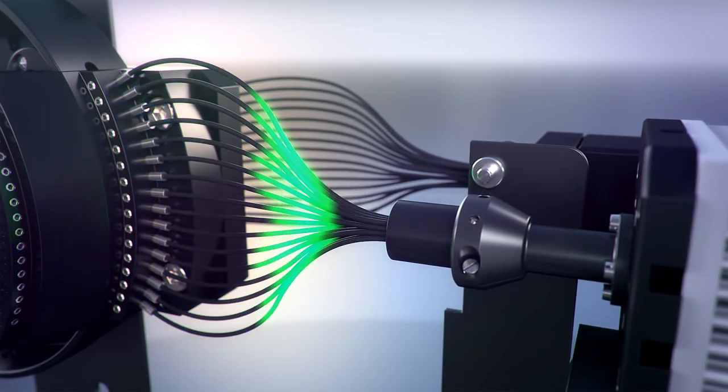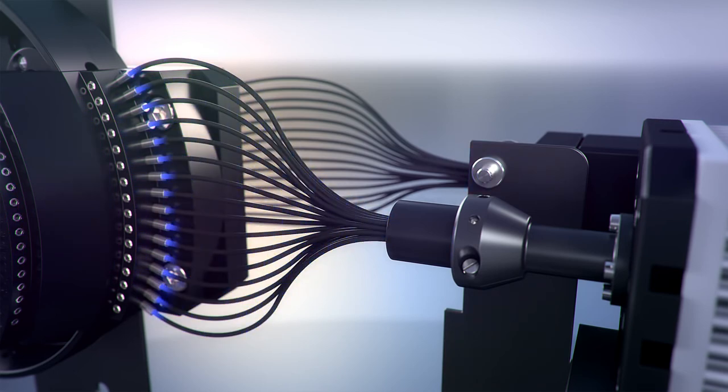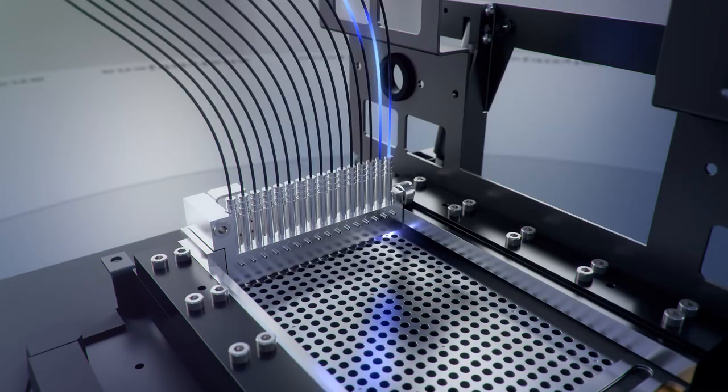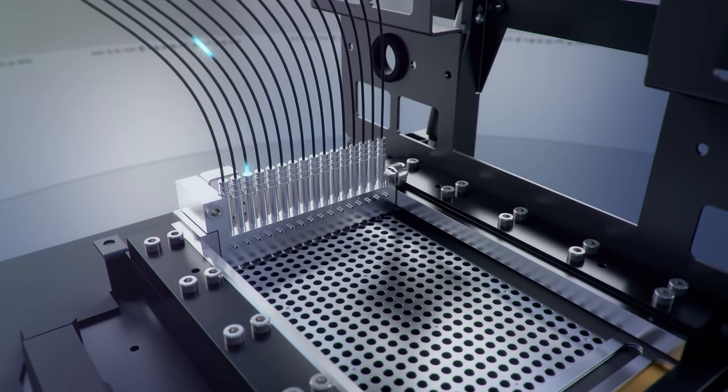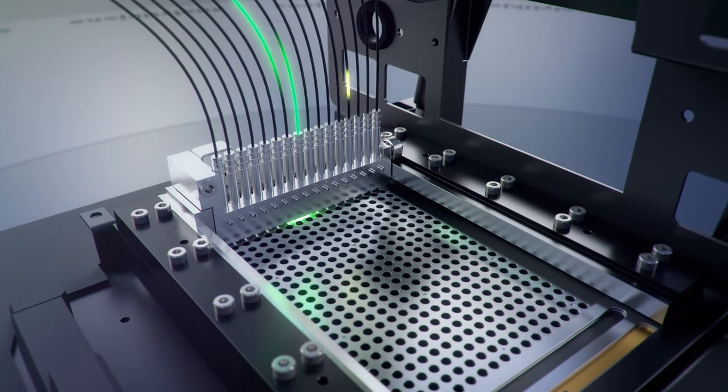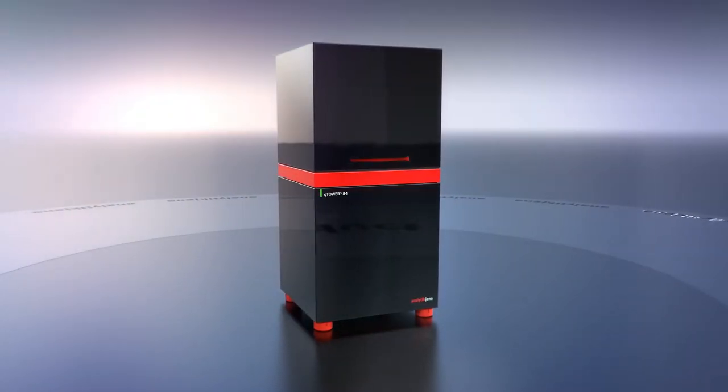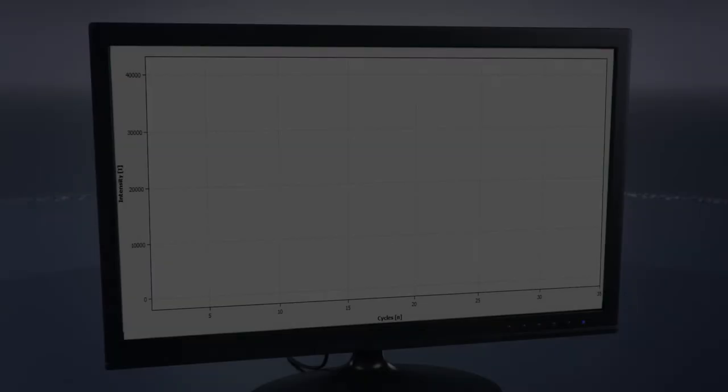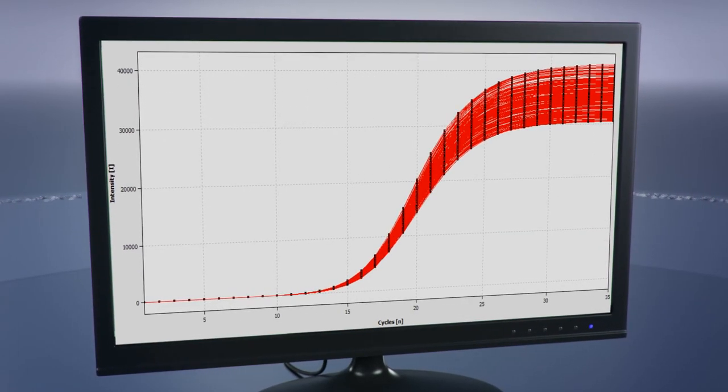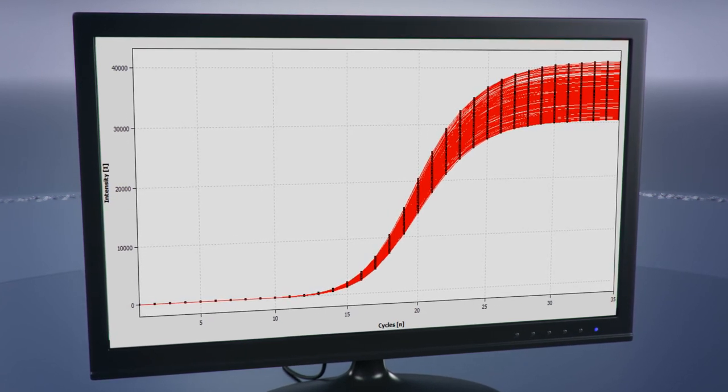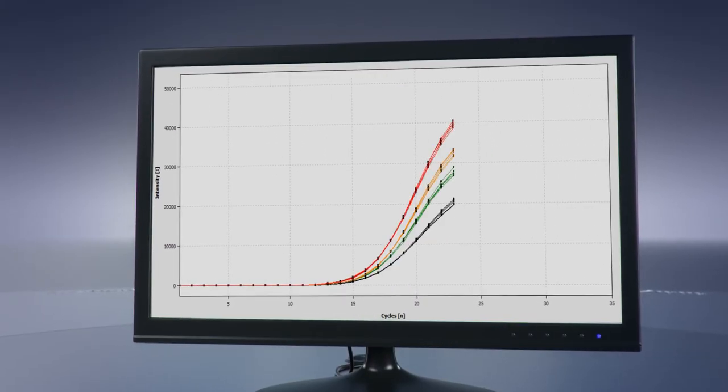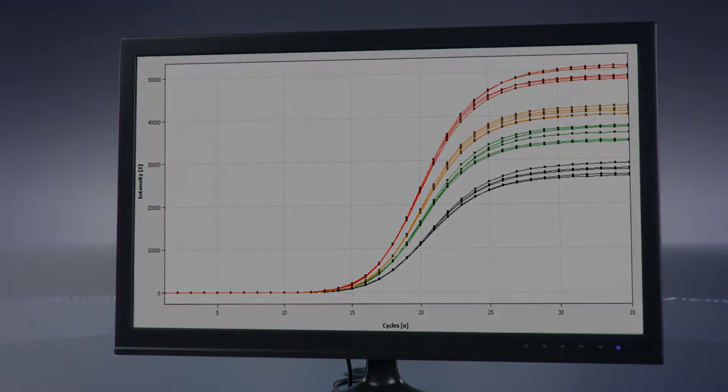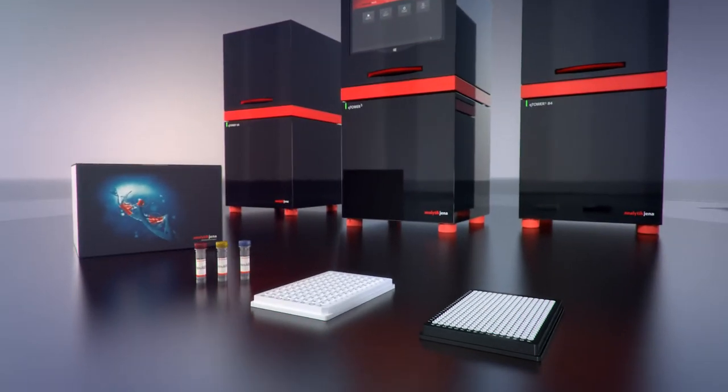The light source is outstanding and the system offers an extremely fast readout time of just six seconds for six-color multiplexing. The products have highly efficient heating rates of up to four degrees Celsius per second. Combined with an unmatched plate readout speed of just six seconds, it guarantees reliable results in record time regardless of the number of dyes used. The linear gradient tool with over 24 columns facilitates peerless precision for the highest level of optimization. Analytic Jena offers a customized complete system that can be tailored to individual applications, throughput, and capacity requirements.